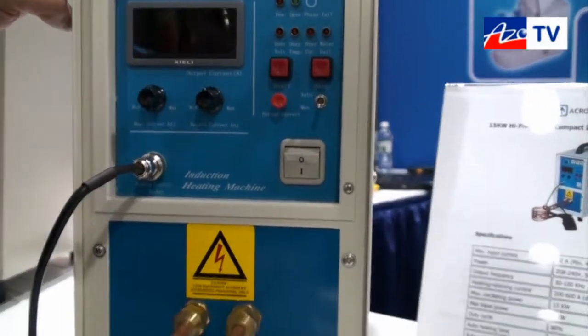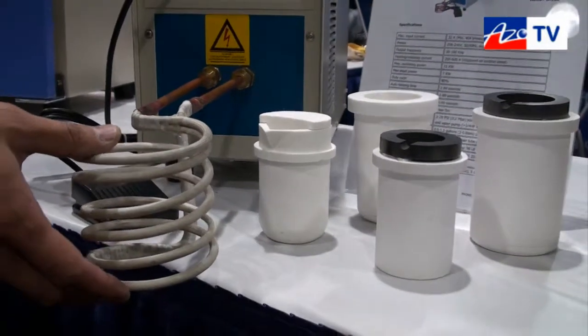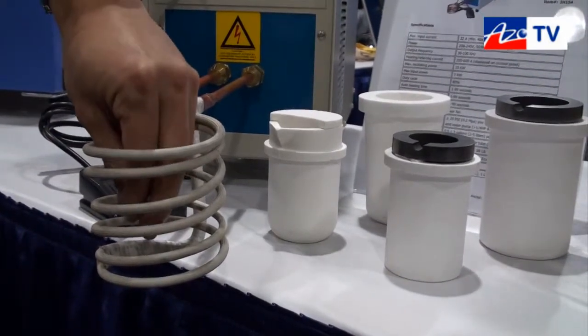Everything is digitally controlled, but I don't have power right now so I can't show the digital display. The machine comes with a coil where you can put your workpiece in to heat it right here.